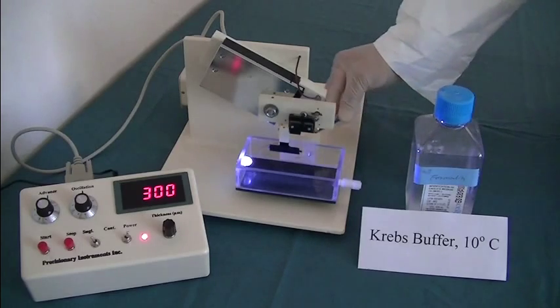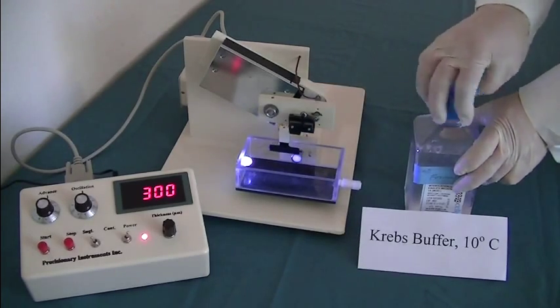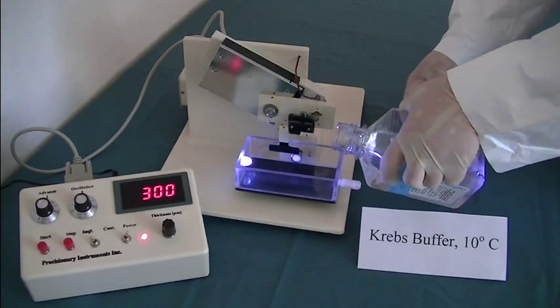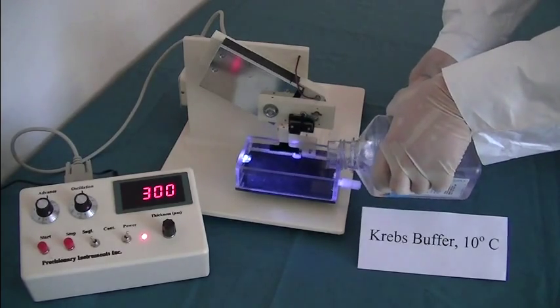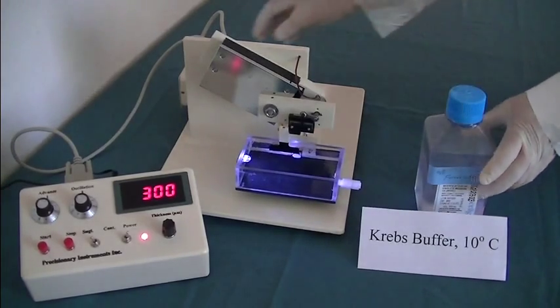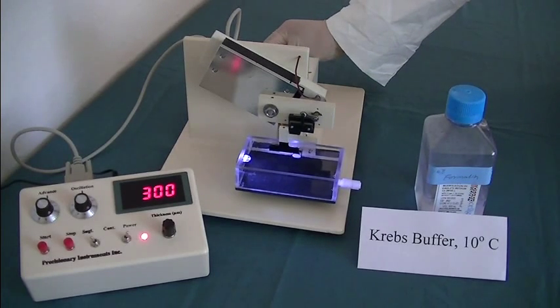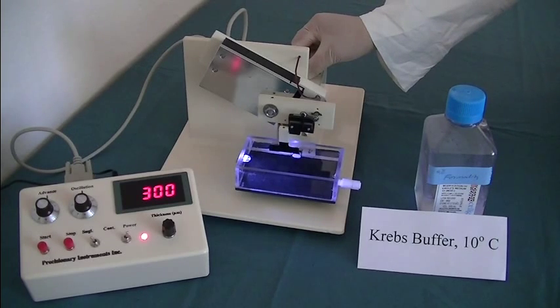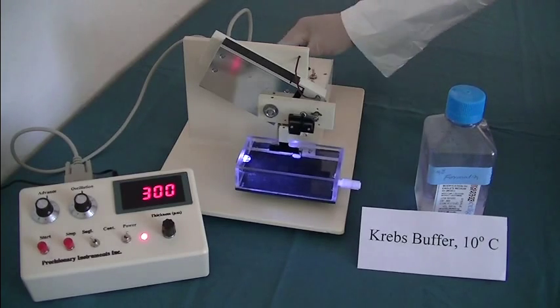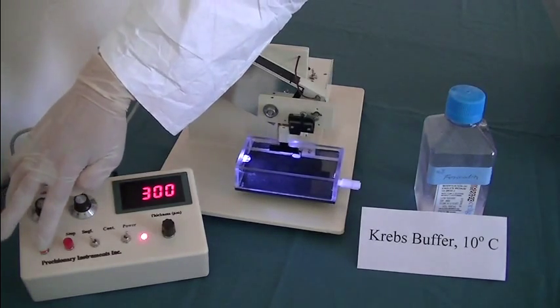Slice sectioning. Put the specimen syringe into the buffer tank. Pour Krebs buffer into the buffer tank. Align step motor with specimen syringe. Press Start button and select Continue Mode.